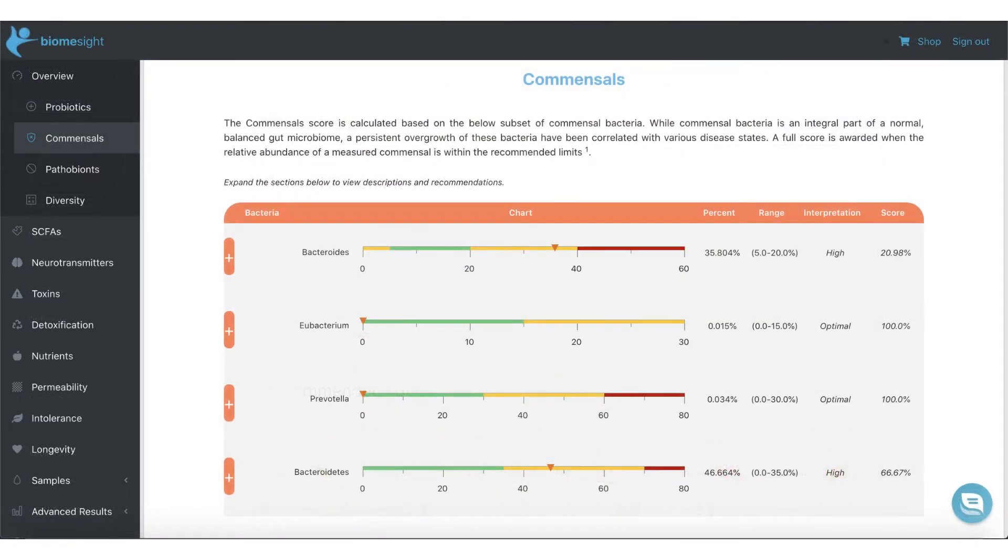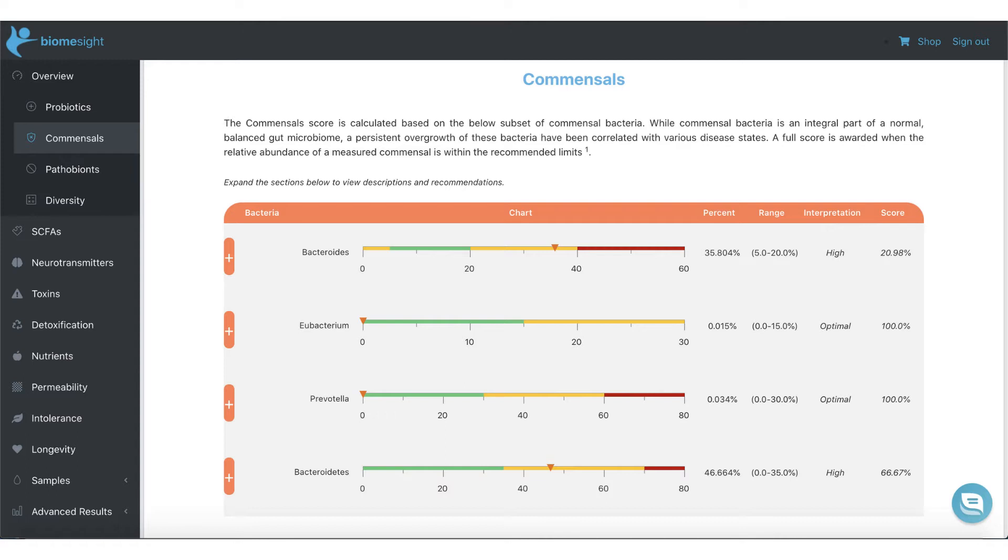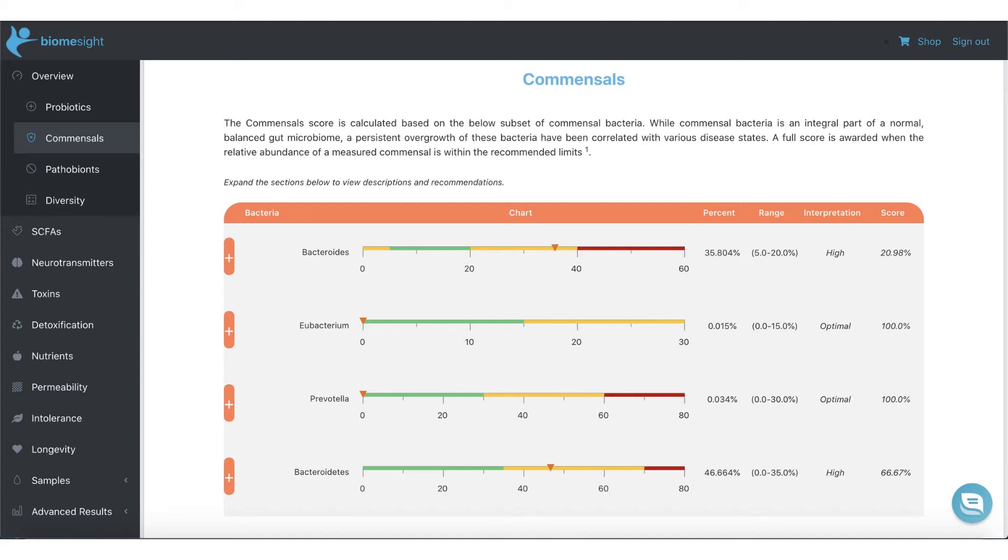The commensal section gives a breakdown of the key bacteria that tend to dominate in a typical human gut microbiome. Once again, you can see recommendations as well as compare your values to the ideal and BiomeSight distribution. Overgrowth in commensals is typical after prolonged antibiotic use, as well as following diets high in sugar and simple carbs and low in fiber and prebiotics. While commensals also produce beneficial short-chain fatty acids, they do not produce butyrate. Butyrate is essential for gut lining integrity.